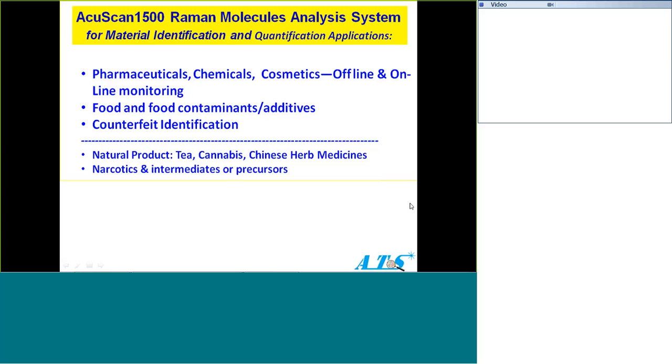You can peel the orange coating off and look at the white powder inside. Compared to without doing it, you get the same spectrum and same intensity. So no problem at all. For a plastic bag or container of raw material, anything that can pass the red laser light through it, then no problem.